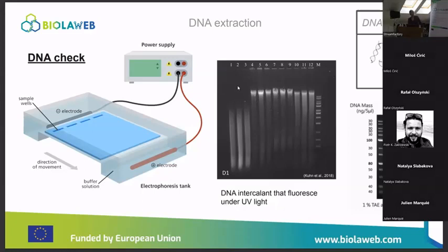If you look at the first DNA extraction, those 3 first wells were extracted using the same protocol, we see that we don't have this high length of DNA, but only the smear. And it's because this protocol of DNA extraction might have degraded the DNA a lot during its process. So it's something you can check at this step.